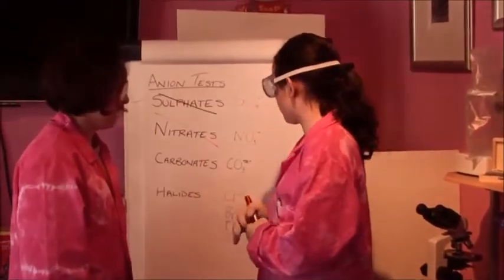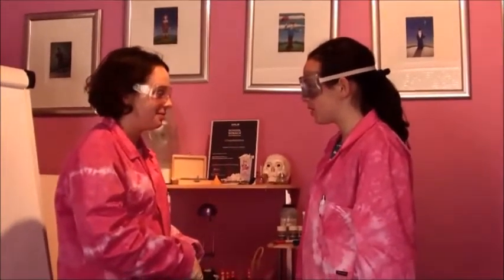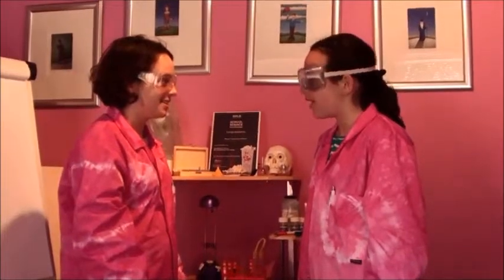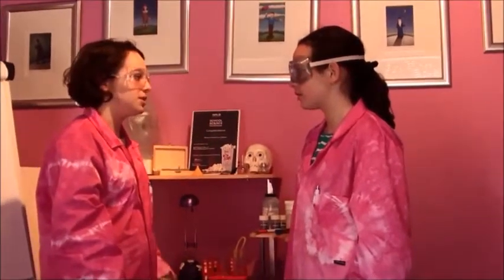Next is the carbonate test. Which one are you going to do? If you simply heat the carbonate, the results could be false. What do you mean? Some carbonates do not thermally decompose, so no carbon dioxide will be produced. Like potassium carbonate and sodium carbonate. Yes, so the presence of carbonates could go unnoticed. Also, if the substance is organic and it is burned, it will produce carbon dioxide anyway, and so will give a false result. What do you suggest?